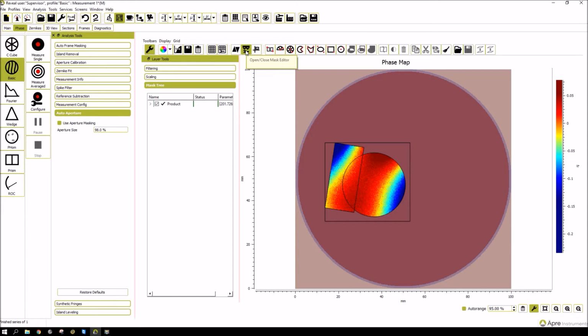And if you look at the steps, here we showed the steps being: you create two standard masks, which are excludes. Then you convert them to include masks, which are shown here now by inverting them. To combine them to show the entire area, you need to do a product or an intersection of those two. And this is where most confusion comes with reveal masking, because you need to follow De Morgan's rules when you're combining masks.